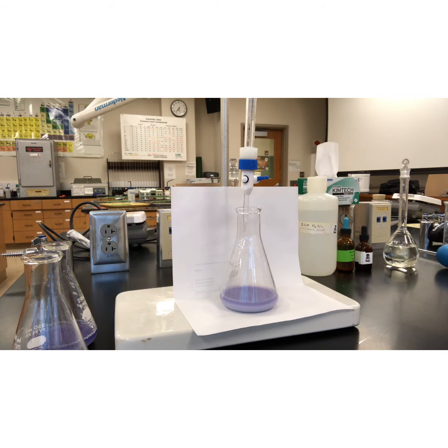Nailed it. All right, so now that you have those concentrations, you can figure out moles, and then you can figure out mole ratios, and then you can figure out your proper coefficients, and pick which one of those equations is the actual equation that's happening here, and then use that to figure out, for part E, the concentration of your unknown.